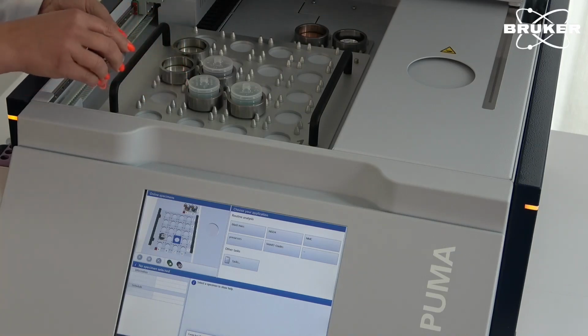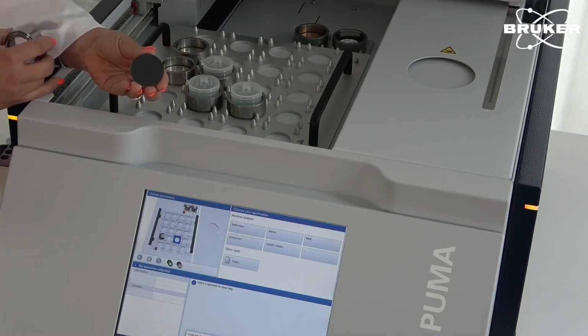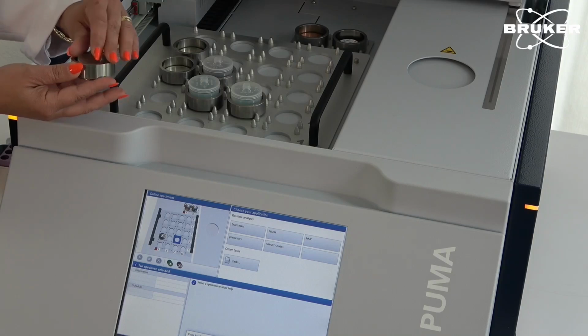Typically, you will also prepare a pressed pellet. So in case you want to analyze lighter elements, but for example also fluorine, then you can prepare the pressed pellets. In this case, you will just use 8 or 9 grams of original material. You will mix it with a binder, 1 or 2 grams of wax, and you will prepare this pressed pellet with a press. The sample is loaded.